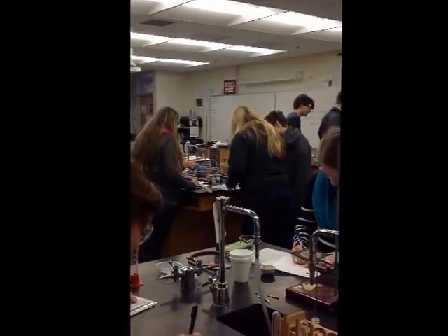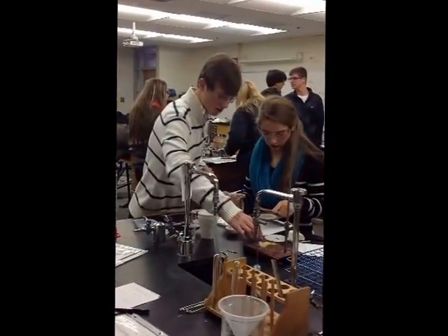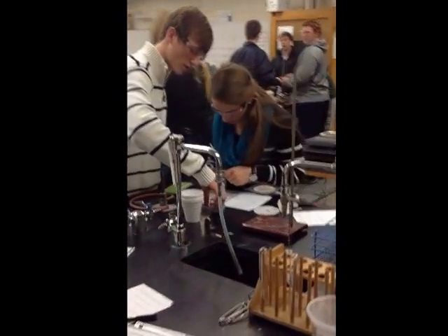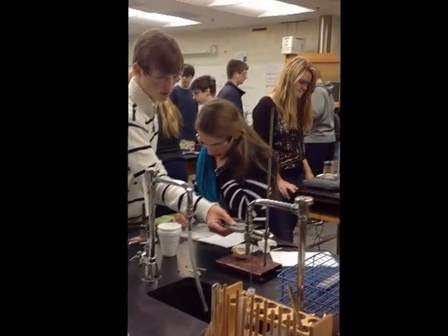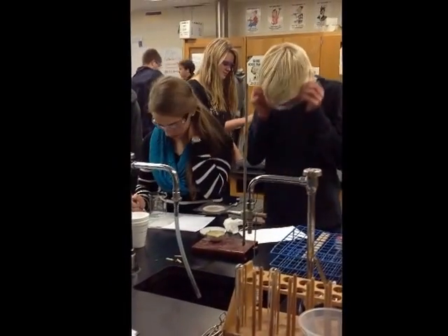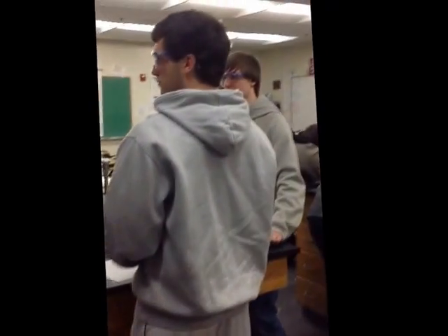Measure the mass of the potato chip. Put the potato chip in the evaporating dish. Okay, so they're putting their potato chip in the evaporating dish and placing it on the ring stand. Notice that they've checked that ring to make sure the ring is 10 centimeters above the potato chip. Using the graduated cylinder, measure 50 milliliters of water and pour it into the beaker.